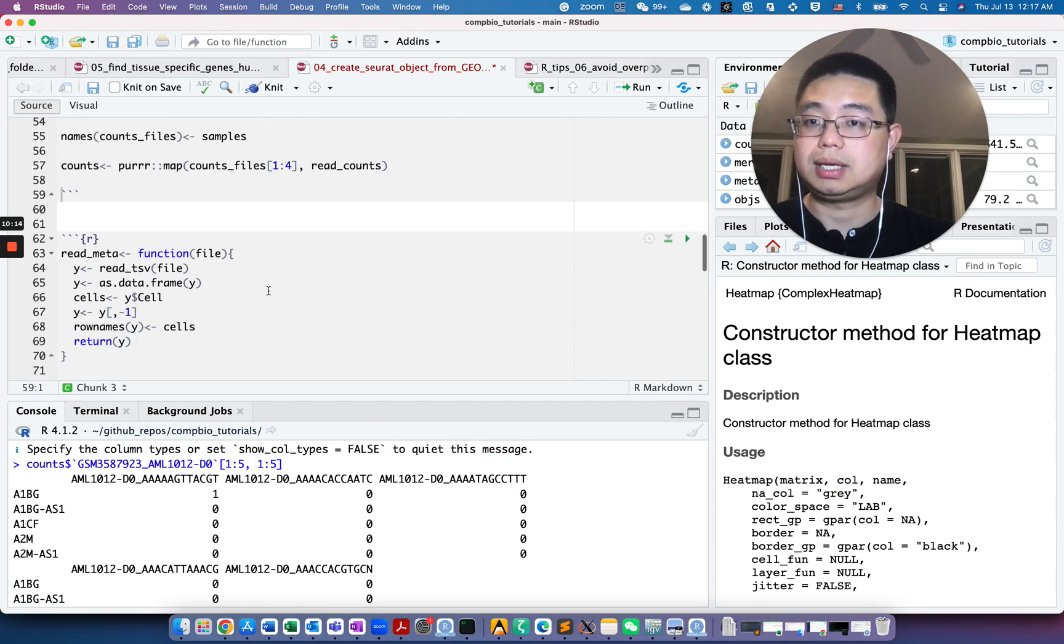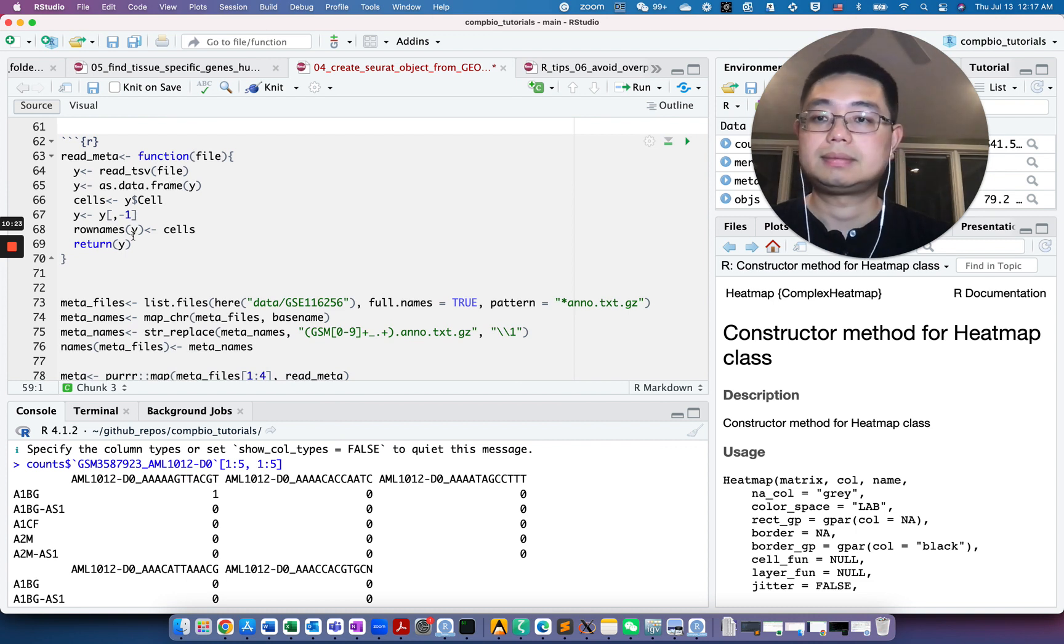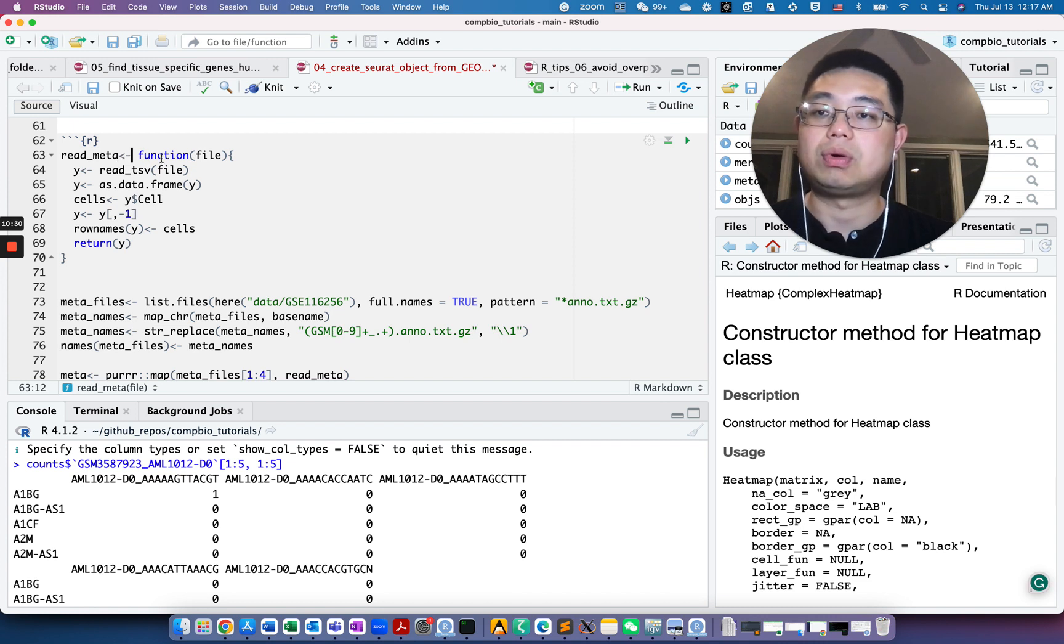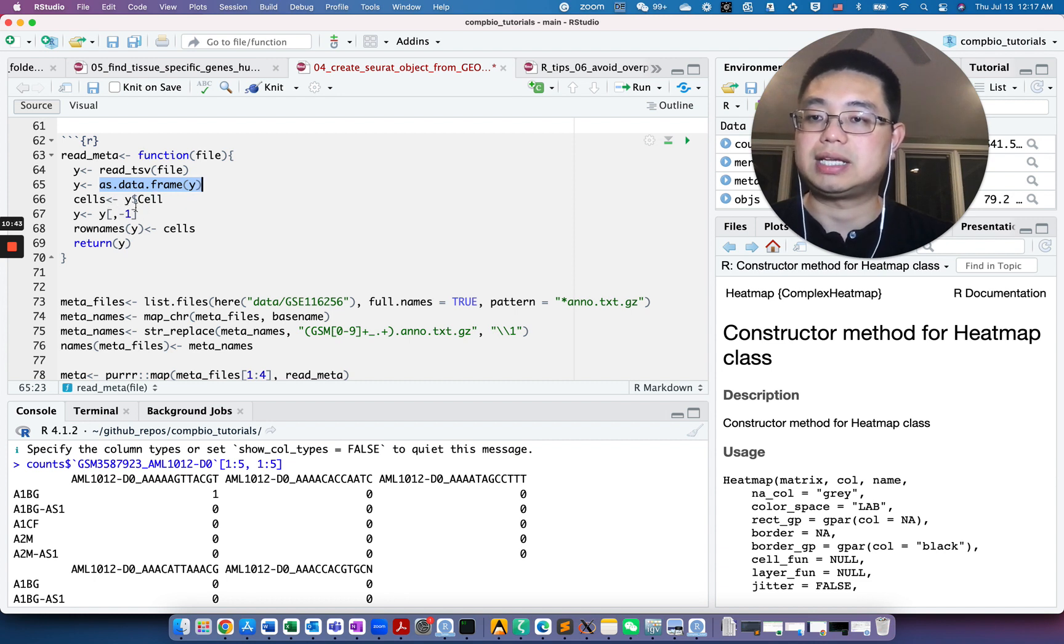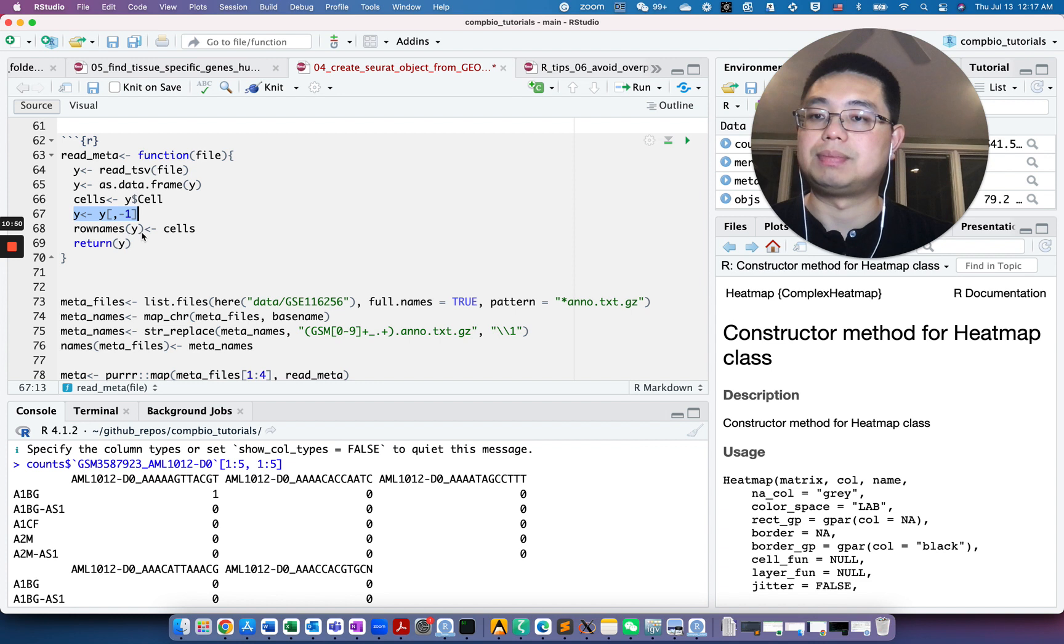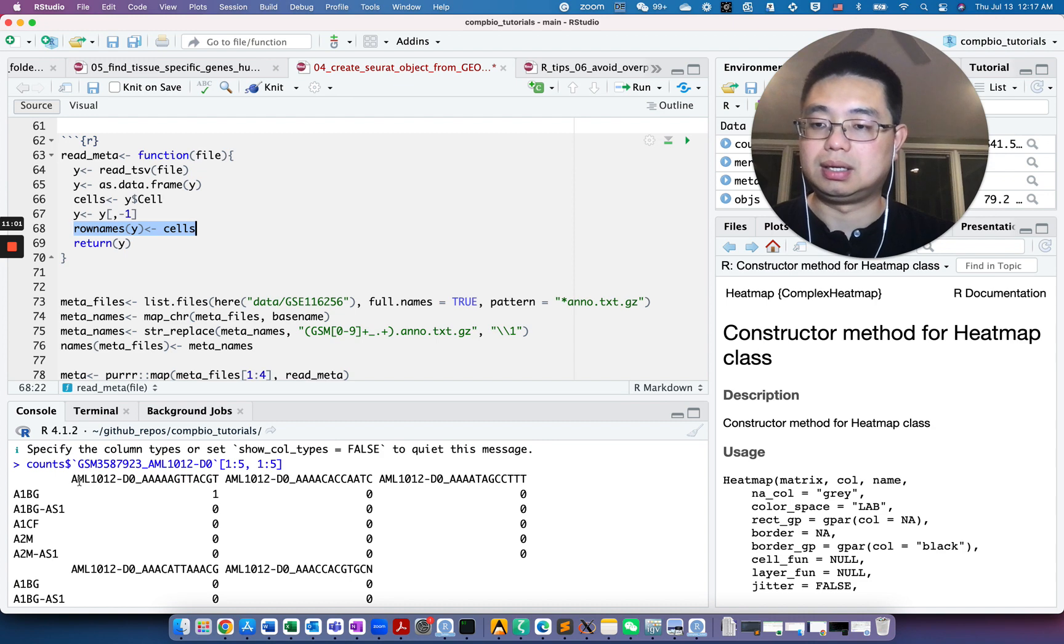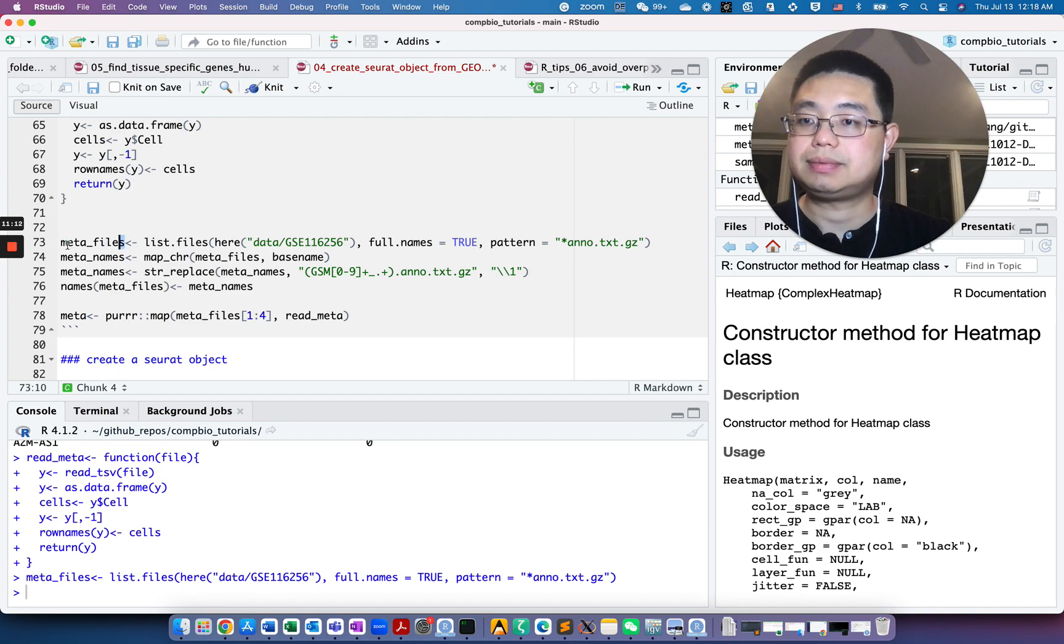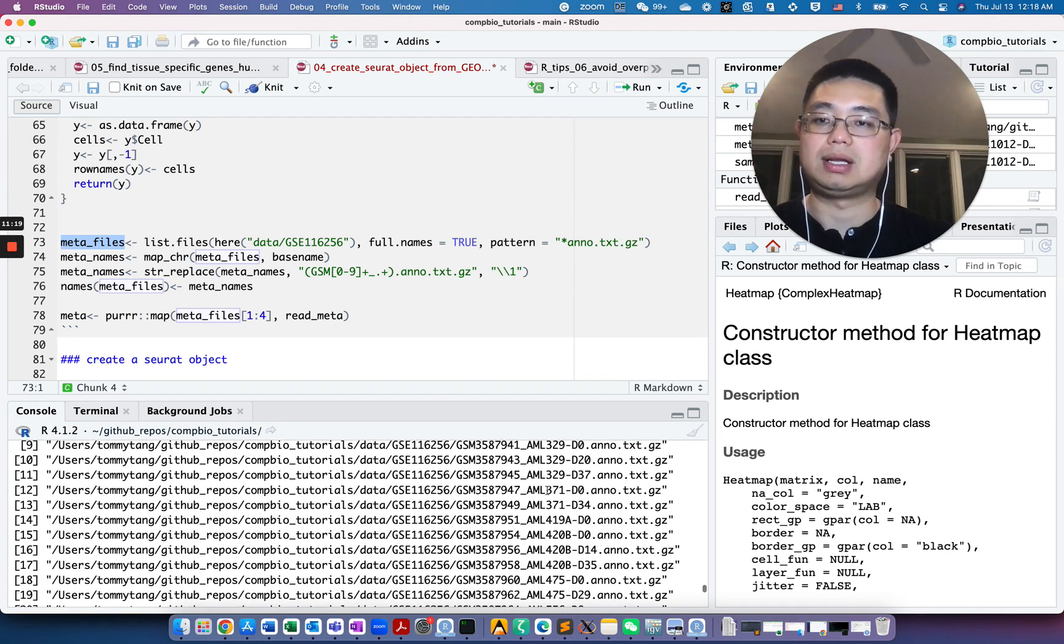Now next we need to read in the metadata file. We create a small function called read_meta, essentially reading that annotation file, turn it into data frame. We need to take out the cell name. The first column is the cell name. We remove that first column and put the cell name as the row name because Seurat uses the row names as the cell barcode to match the count matrix. Similarly, we will first list all the meta files here. So 43 again. Make sure the order of this is the same as the count matrix, but because we use list.files, usually it should be the same.